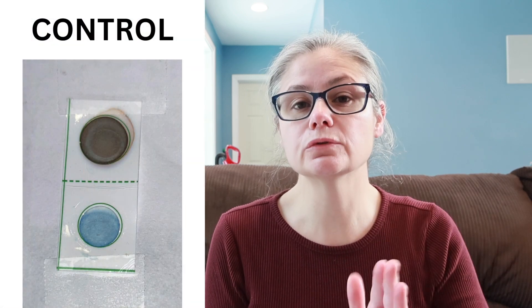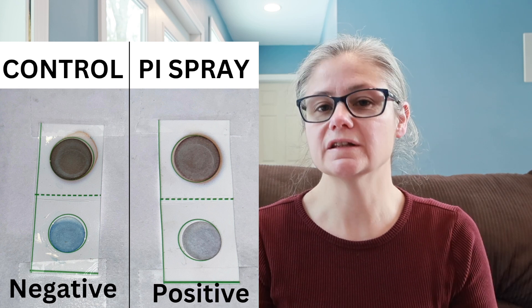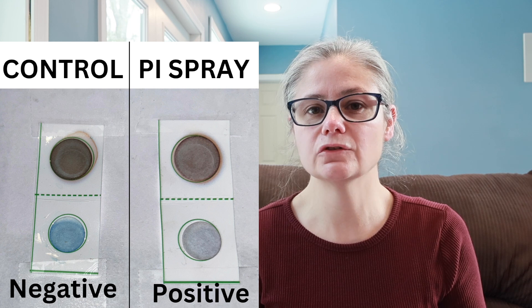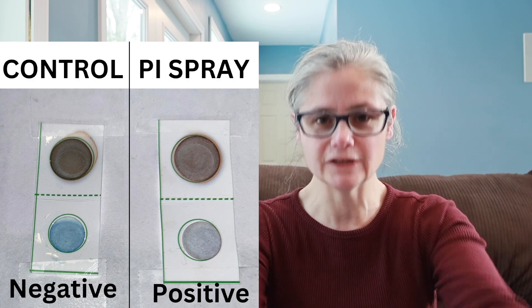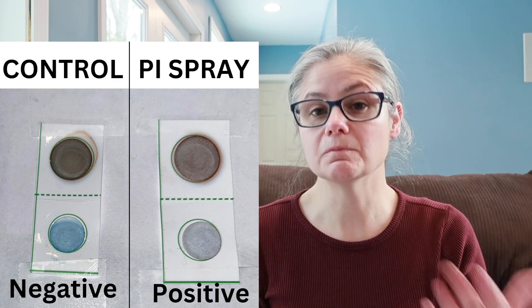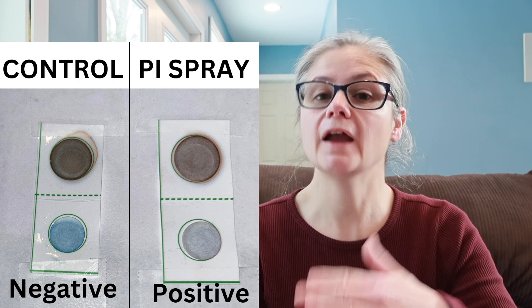Now for some results. I did this test on two separate days, so I have two separate control strips, and I'll show each sample compared to its control. The day one control shows a blue color on the bottom that we'll compare all other tests to. Looking at the poison ivy spray — remember, this is not a pesticide, it's an herbicide, and its ingredients didn't match any of the detection targets on the card. But we can definitely see a difference in color: the poison ivy sample has a whitish-gray color while the control has a bright blue.